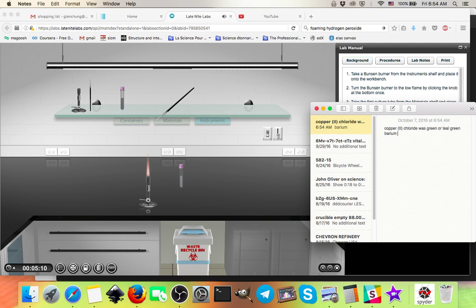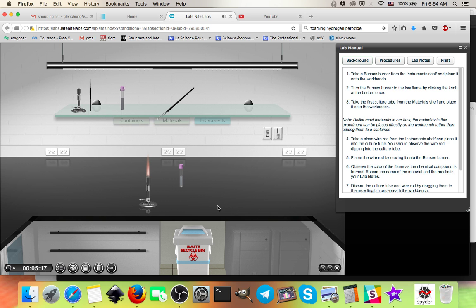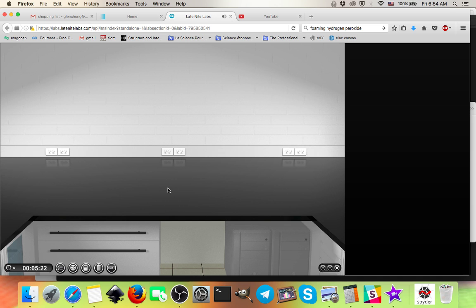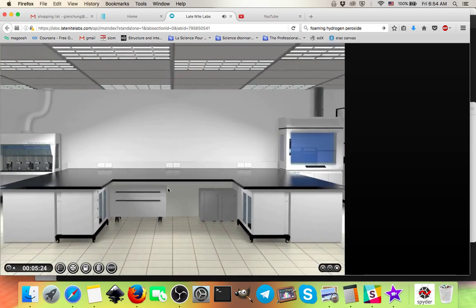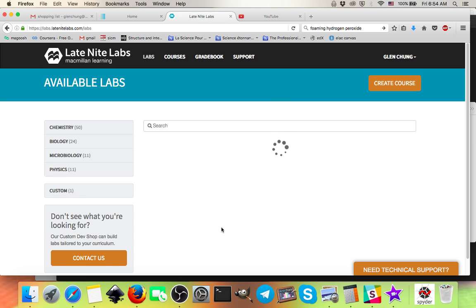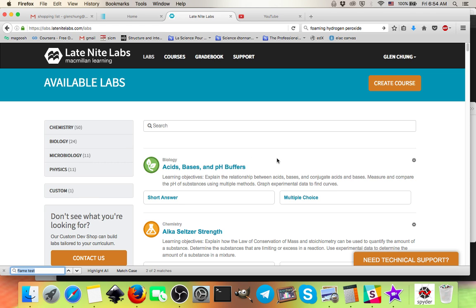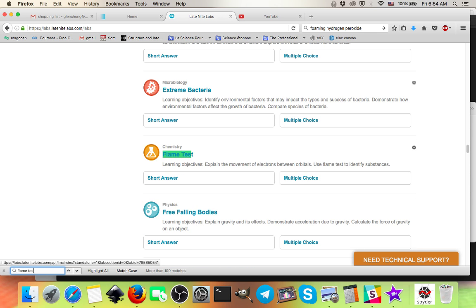So once you finished 5 observations here, please proceed by exiting the lab like this. Yes, I want to exit. Yes, now I have exited the lab, and now you must complete the questionnaire. So if you type flame test again, there will be a short answer document that you can fill in.